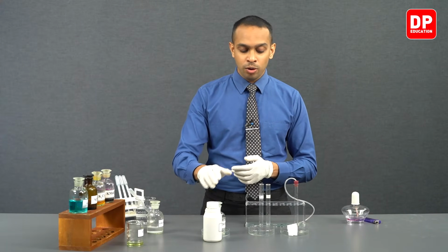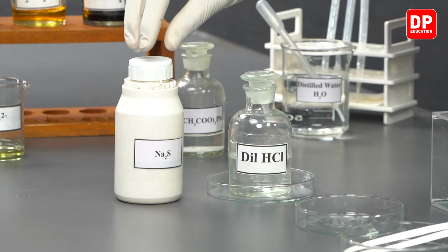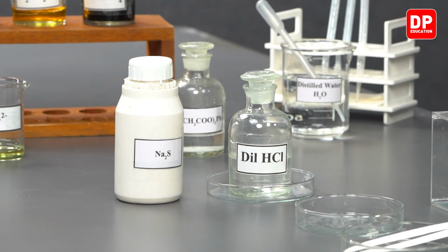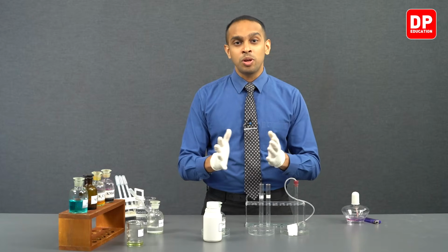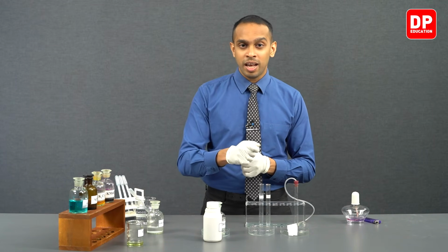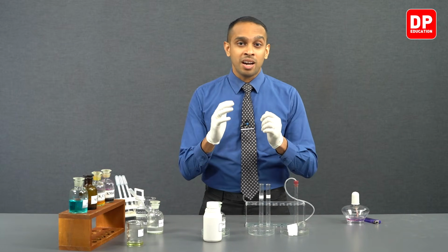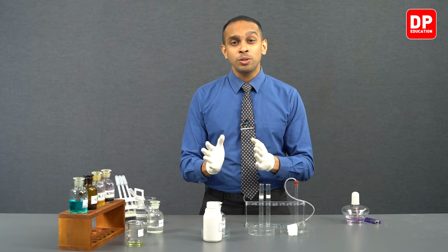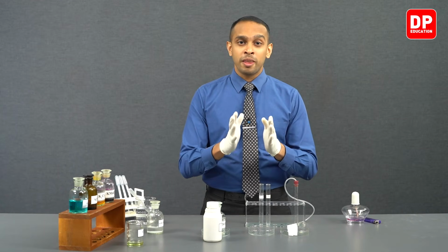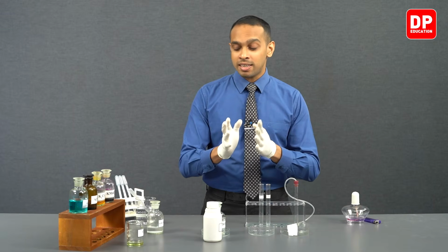So students, now we can move on to adding a small amount of sodium sulfide into a test tube, and we will be adding hydrochloric acid to that test tube, and it will produce hydrogen sulfide gas. And with the help of a delivery tube, we are going to introduce this hydrogen sulfide onto a piece of filter paper that is soaked in lead acetate.